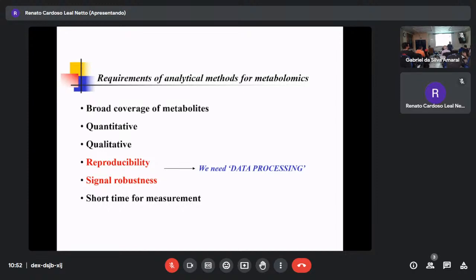When you change the parameters or the conditions, the signal changes. So signal reproducibility is more or less a quantitative feature. Robustness is a simple question. A simple example: if retention time is changing every time, sometimes 1 minute, sometimes 1.1 minutes, then the variable length is completely changing. Is that signal robust?